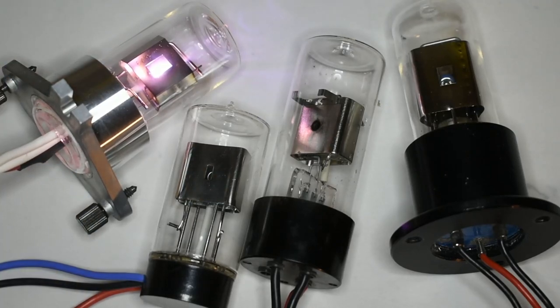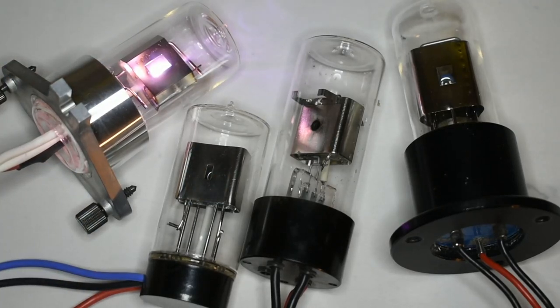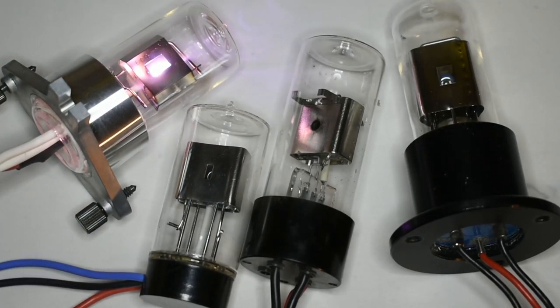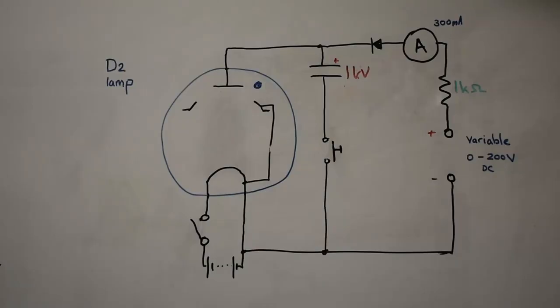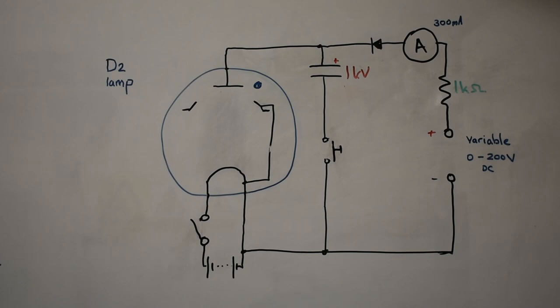So let's have a look at how these are driven. Okay, here we have this basic circuit layout for running a deuterium lamp, just the basics for it.